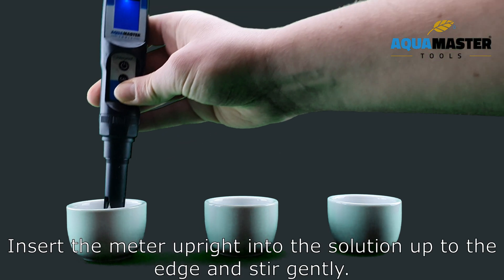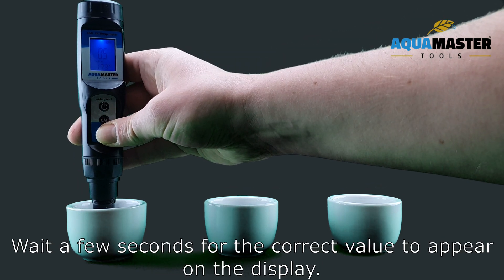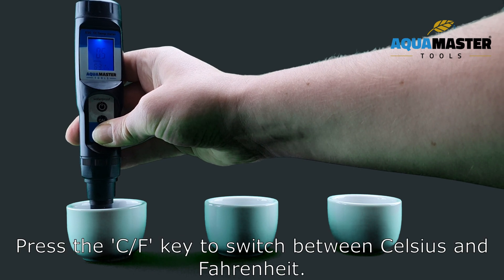Insert the meter upright into the solution up to the edge and stir gently. Wait a few seconds for the correct value to appear on the display. Press the CF key to switch between Celsius and Fahrenheit.